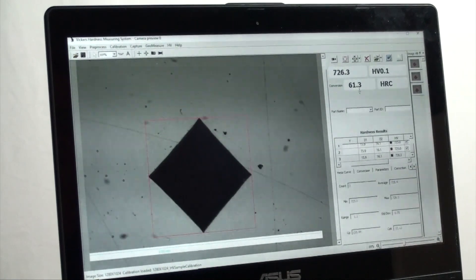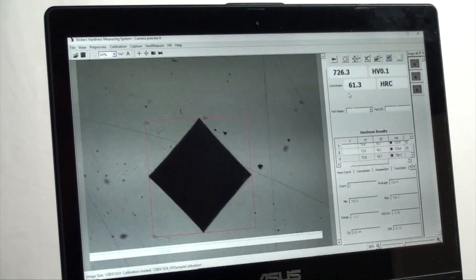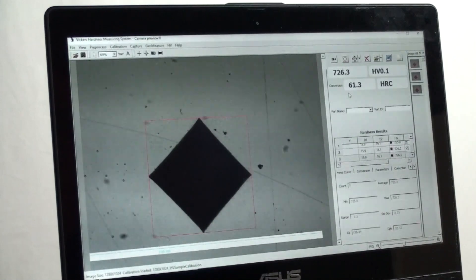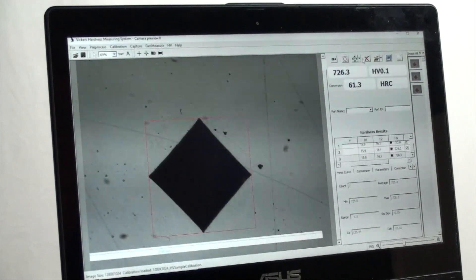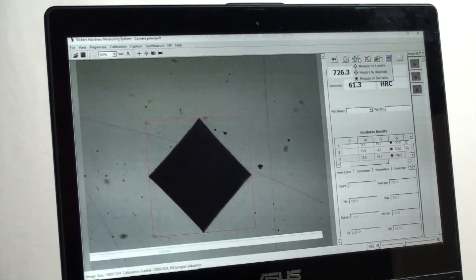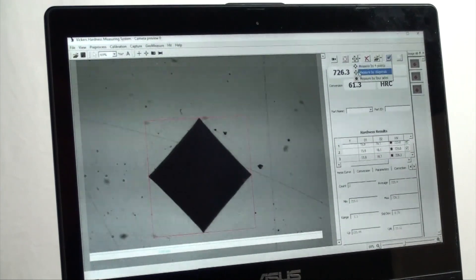If you have an A version of the software there is no auto measure button available. One must choose to measure either using diagonals or points on screen. B software versions come with auto measure.